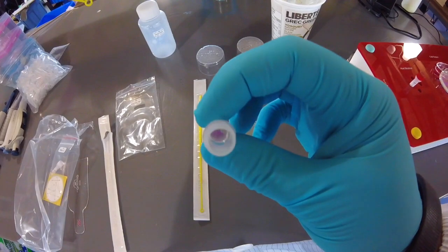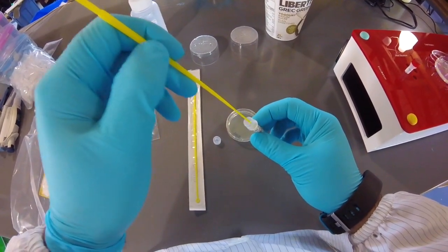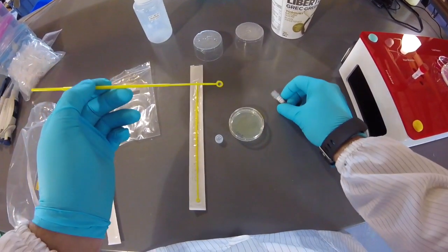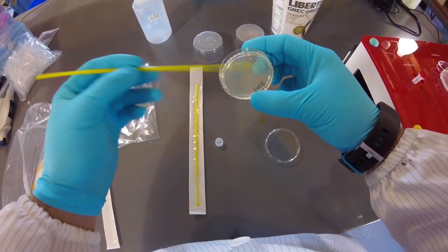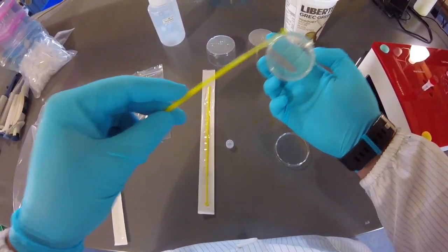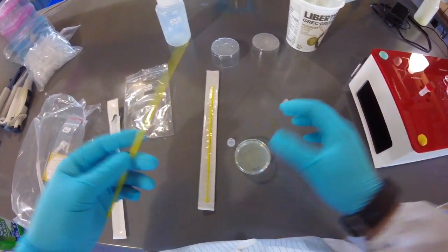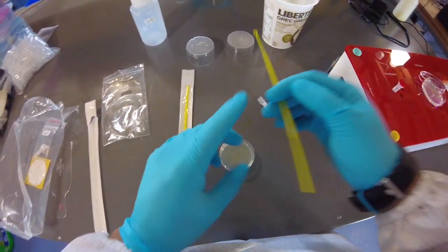You might be able to see some colorful cells in there. So again, you just need to touch the top. You can see that this is wet. Okay, so that suggests there's lots of cells on there. And I'm just going to put this on here. You can draw a picture if you want. It's a little difficult when it's this wet to draw a picture, but I'm just going to spread them out a little bit like that. It's fine. Whatever shape you want. There's no special streaking method here. Again, the idea is just to put cells on a plate and see if they grow.